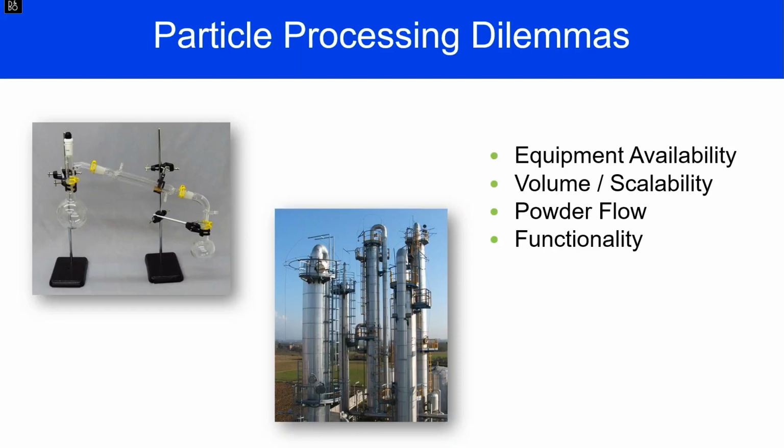So when you're starting in the lab, you're picking a process to actually do whatever you're doing, drying or agglomeration or whatever. And you know something? We are always limited on what you have, unless you're really lucky and you have one of everything in the world. I come close to that, but we still have to make choices. And when you make a choice, you kind of set the trail for the rest of your project. And it's hard to change from a grinding process or a drying process to something different when you find out that you didn't choose exactly the right thing.